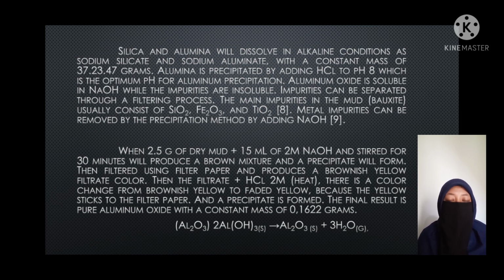Okay, silica and alumina will dissolve in alkali condition as sodium silicate and sodium aluminate with a constant mass of 37.2347 grams.